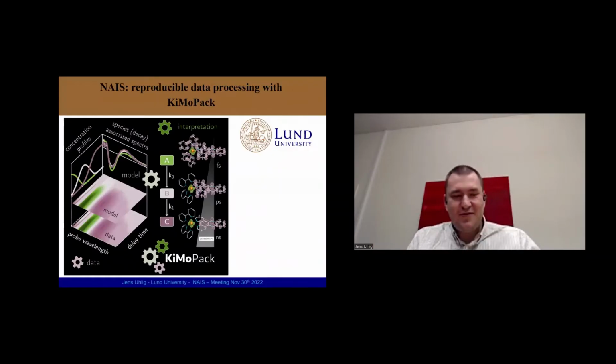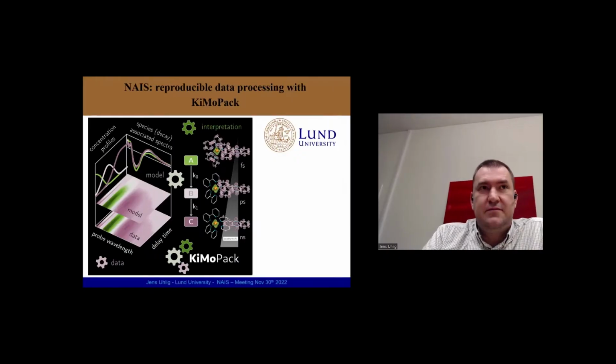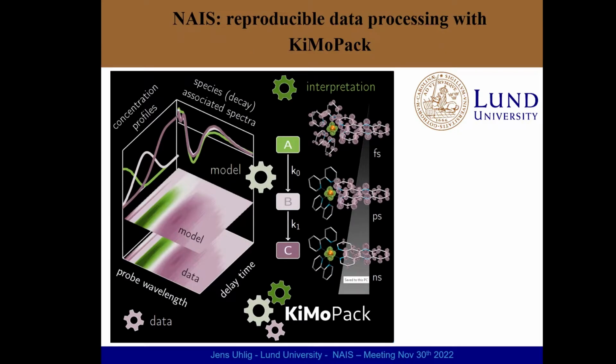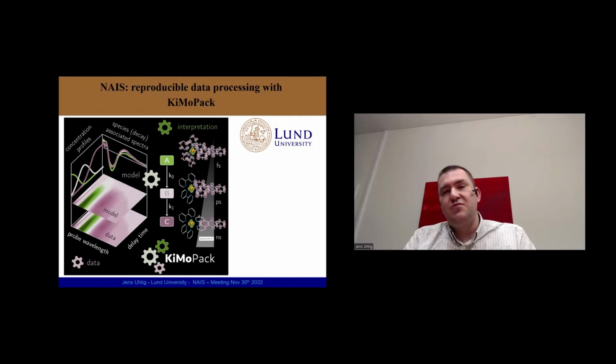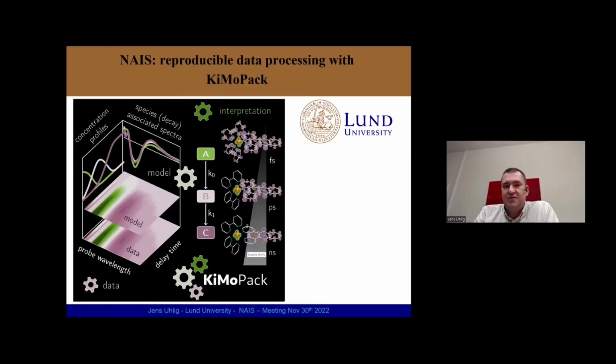So today I'm going to present KiMoPack, which I've developed over 12 years, in the past, after need. When I started working with time-resolved data, I wanted to find a tool to plot something. Then we started modeling. At that time, and also since then, I looked around and didn't really find something which works for me. So I developed KiMoPack for our group and then shared the tools.